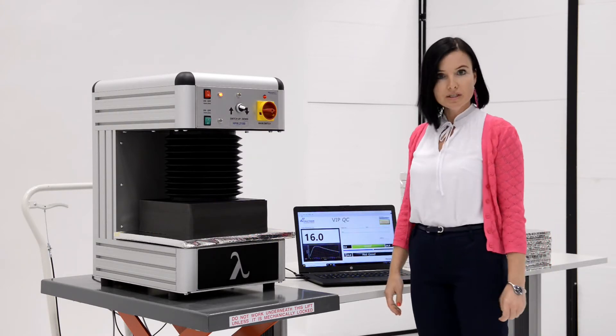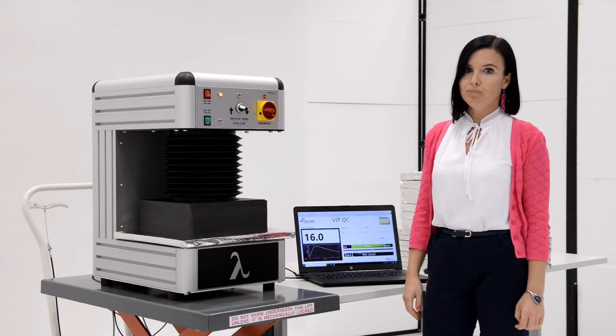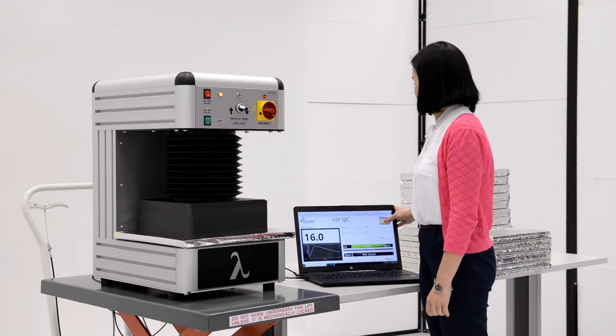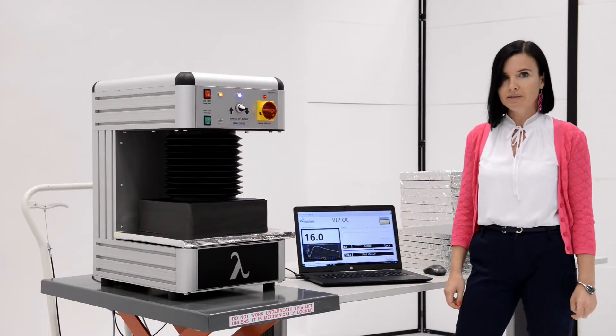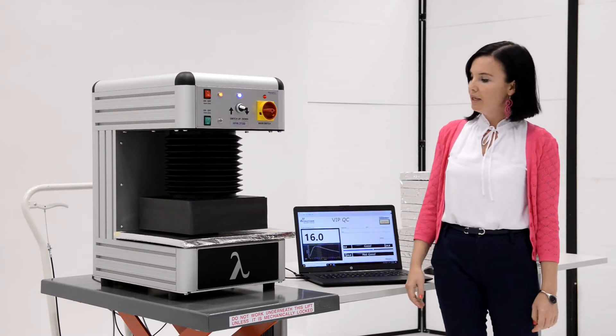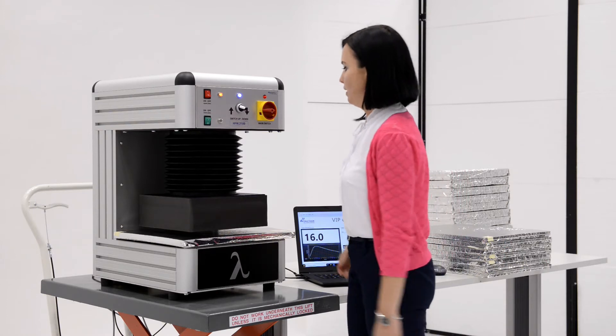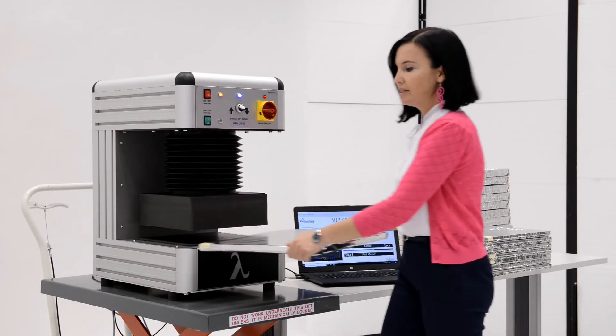When the temperature is reached and the signal light turns green, we stop the program by pressing the save button. Then the plate will start lifting automatically and you will take out the sample.